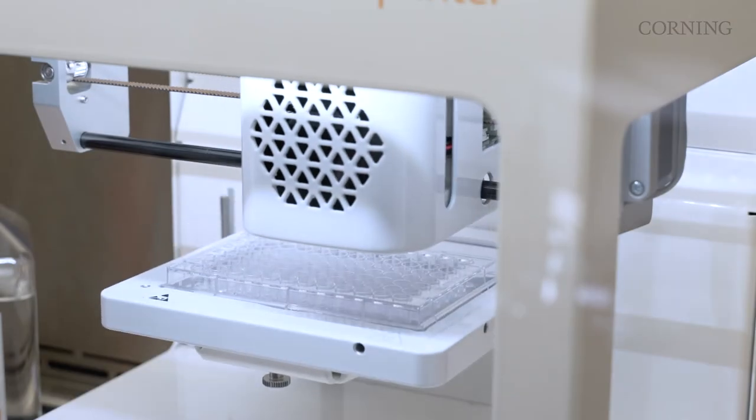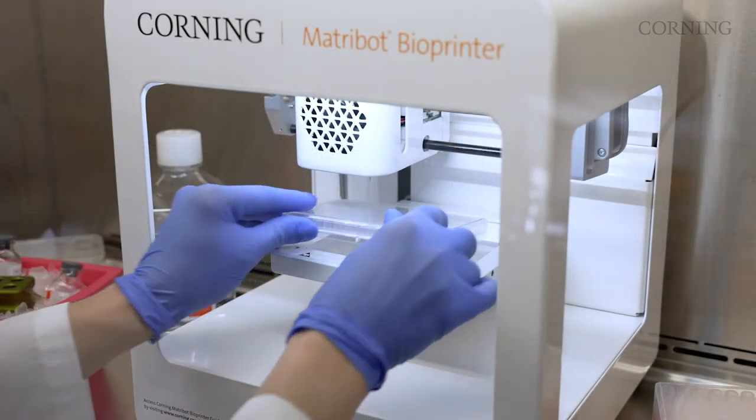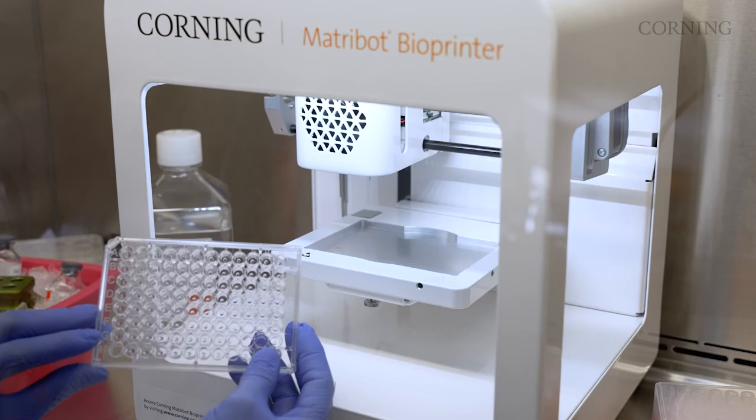The system is designed to be a flexible, easy-to-use, semi-automated solution that reduces manual inconsistencies, all in a small footprint.